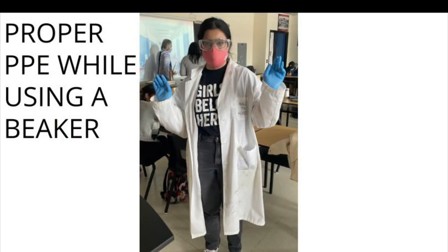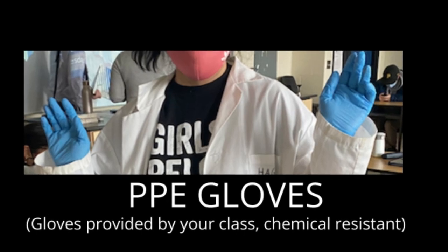Make sure that you are wearing the warranted PPE safety equipment such as safety goggles, gloves, lab jacket if needed, and closed toe shoes.